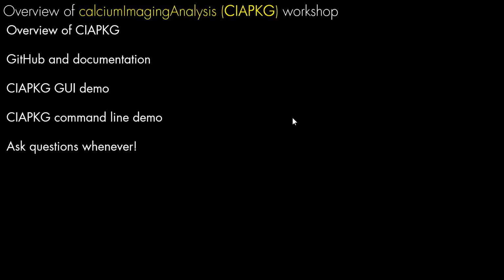So today I'm basically going to do an overview of calciumImagingAnalysis, or CIAPKG. I'll go through the GitHub and the documentation, and update that documentation now. Then I'll do a demo of the GUI mode of CIAPKG, and then a demo of the command line. And whenever people have questions, they can just chime in and ask.